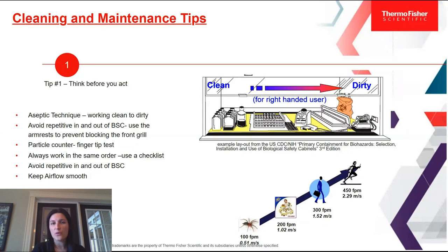You're also going to want to avoid repetitive in-and-out motions in the BSC. Make sure that when you're working in the BSC you have everything you're going to need, and avoid your hands going in and out repeatedly — because every time you put your hands back in, you're literally pushing air from your outside environment onto your work surface.